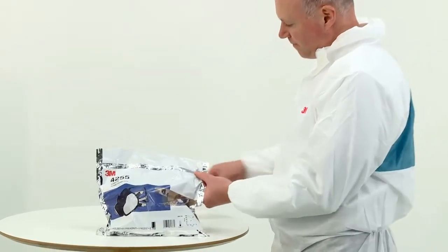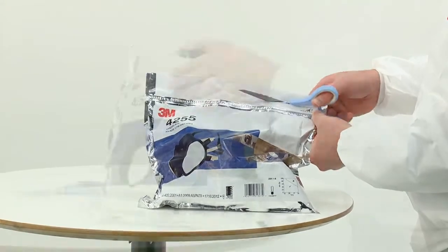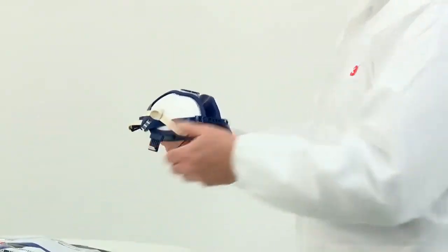Prior to fitting your respirator, make sure that your face is clean shaven. These respirators should not be worn with facial hair under the area of the face seal. Make sure that long hair is tied back and jewellery is removed so that it does not interfere with the seal to the face. To begin, open the bag ensuring you do not damage the resealable strip. Remove the respirator from the bag and inspect it for damage.